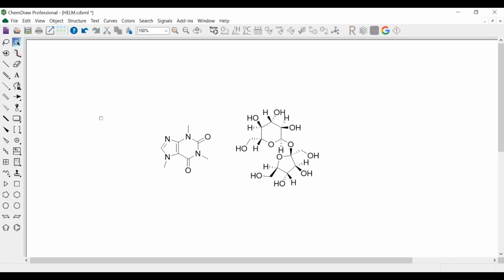But that native understanding of, hey, here is a cheminformatics language, it's a string of text, but the fact that I can literally just copy that bit of text, come back into ChemDraw and hit Control V, and it translates into a structure, that is incredibly valuable. And that's something we're seeing more and more as folks get into these areas where you're working with people in the cheminformatics space.